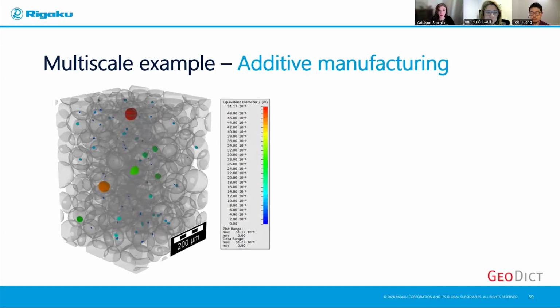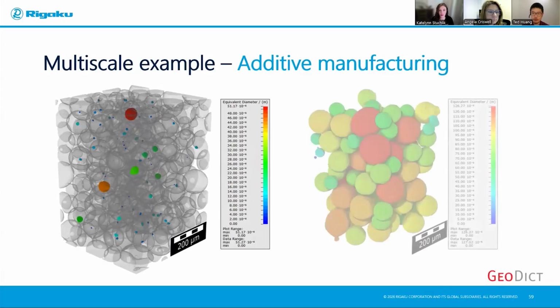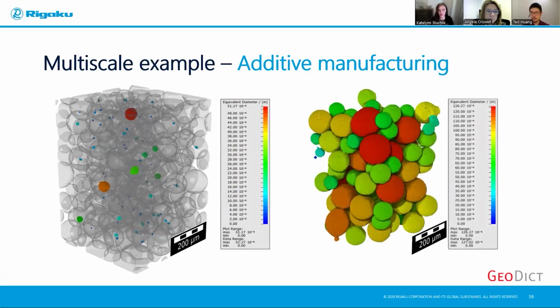This is a very big topic for additive manufacturing, powder quality and powder porosity, because porosity, you cannot see until you cut it open, right? So with conventional techniques, you have to do 2D sectioning, SEMs, and this is very popular in additive manufacturing because CT just shows you in 3D and you just scan it. This is one example. And you can always ask other questions like the morphology and size distribution of the powder. They're also very important in terms of how they behave in the melt pool when you're doing the printing.